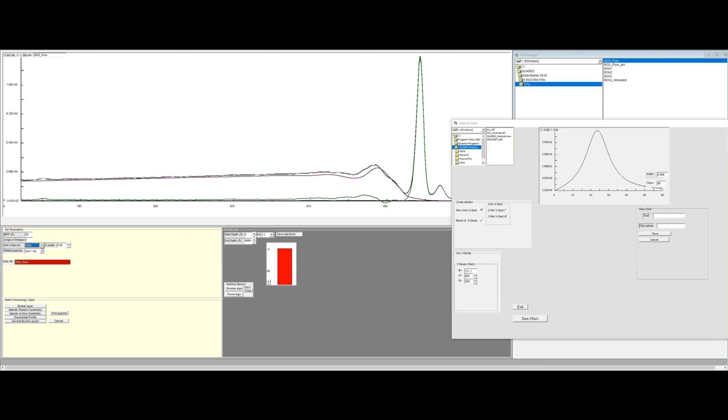So actually this external cross section would probably be slightly more accurate to use than the default silicon dioxide cross section. If you use this in practice, I've done that for the silicon dioxide islands formed on silicon, you get about the same result to within a few percent. So it's not that critical how you do it.